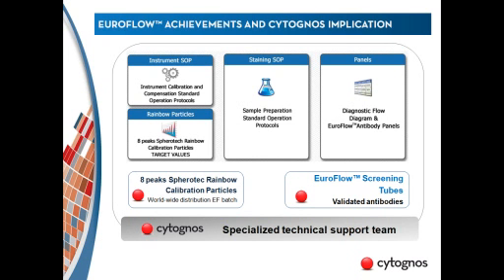First of all are the instrument calibration and compensation standard operating protocols. If you want to follow EuroFlow, it's necessary to calibrate and compensate your cytometer in a specific way. This is nothing strange. They just wanted to write down what everyone was doing in the lab, but with some tips and some standard procedures, just to have the same fluorescence intensity and the same results independently of the lab that is doing the testing.